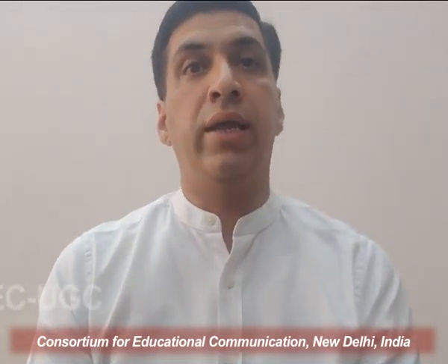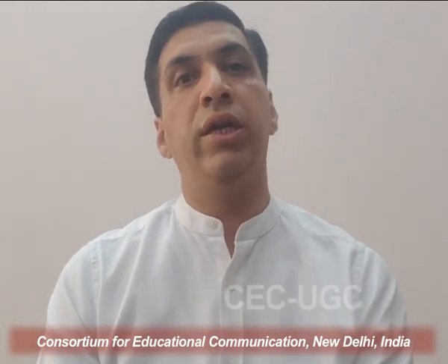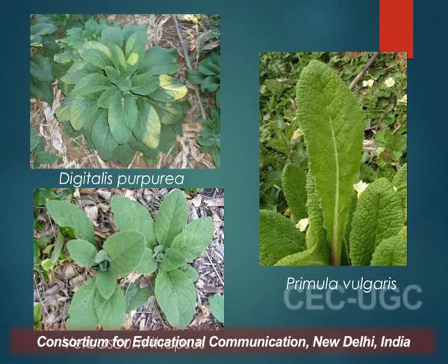So now we move on to how these qualitative microscopic characters help in differentiating the drug from its adulterant, or in its identification. Now if you look into this slide, it has three pictures. First is Digitalis purpurea, second is Verbascum thapsus, and the third is Primula vulgaris. Now we all know that Digitalis purpurea is a well-known cardiotonic drug, and the other two, that is Verbascum thapsus and Primula vulgaris, are its adulterants.